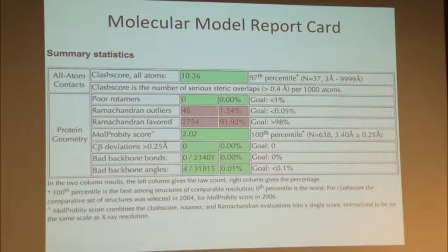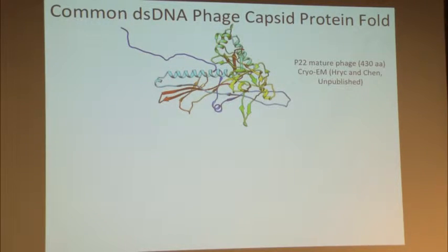angstrom. I would say in the last year, there are a number of structures exceeding this resolution level. Water molecules have been seen, and side chains are better looking than the ones that I showed you, in other systems. Now, once we do this, we ask what kind of biology we learn from these kinds of structures. So the first thing we learn is, when we look at the sequence level, this virus protein does not look like any other protein in the gene bank.